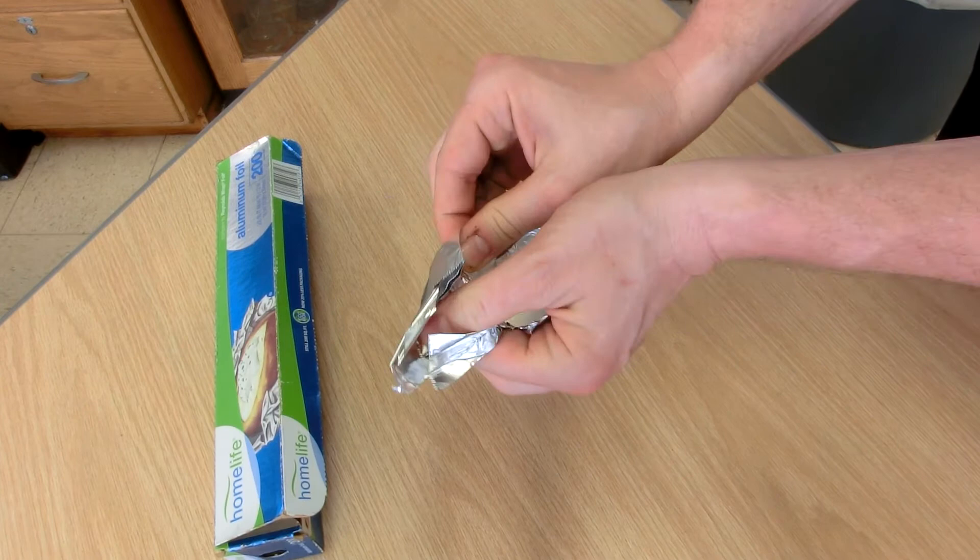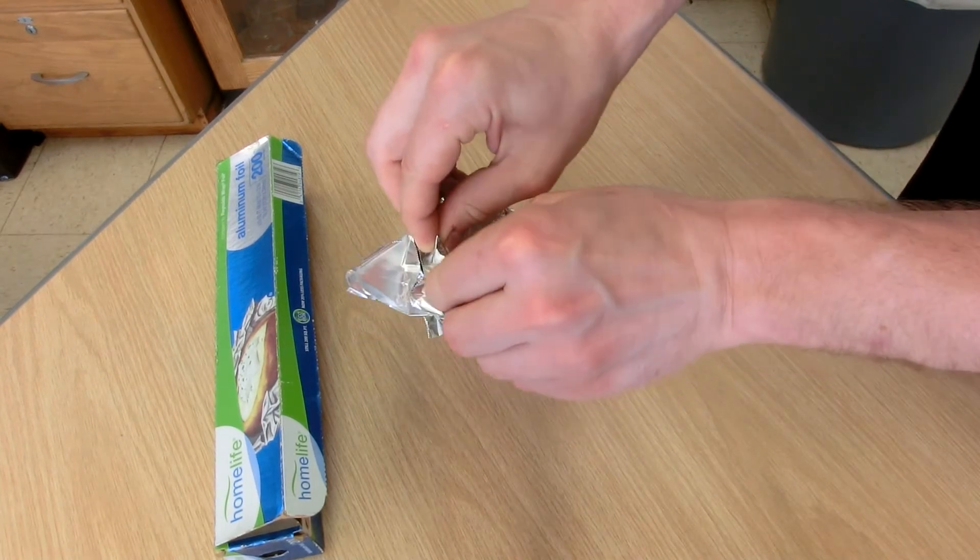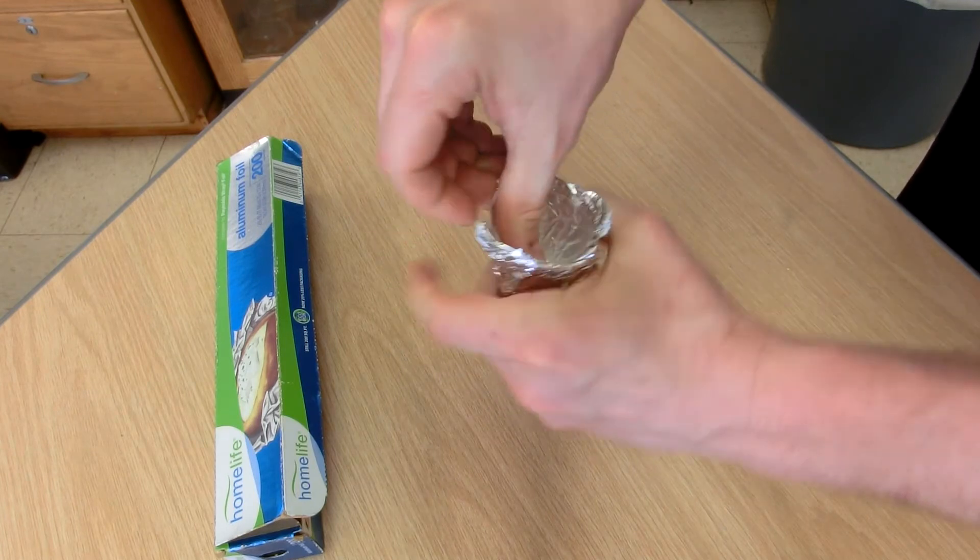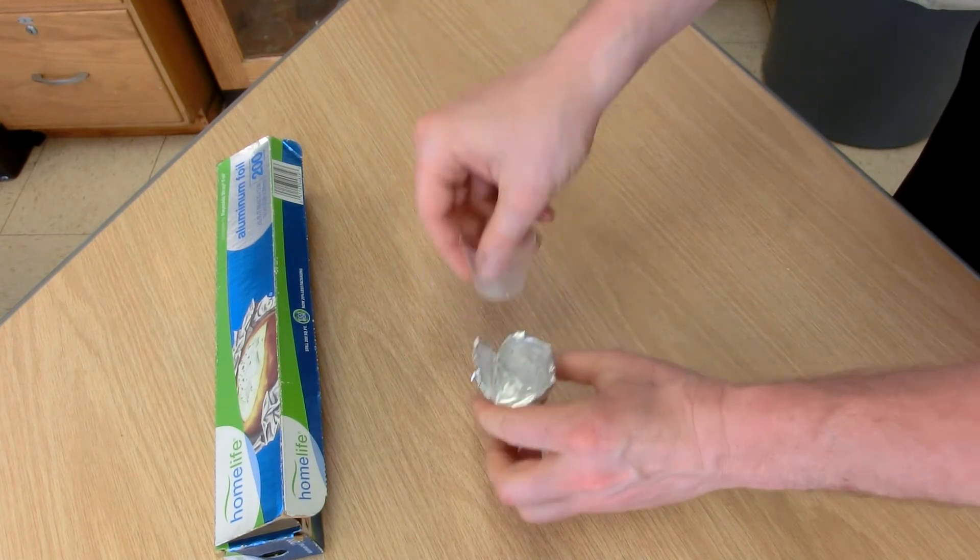Fold it across the top, and you've basically made a cup out of aluminum foil.